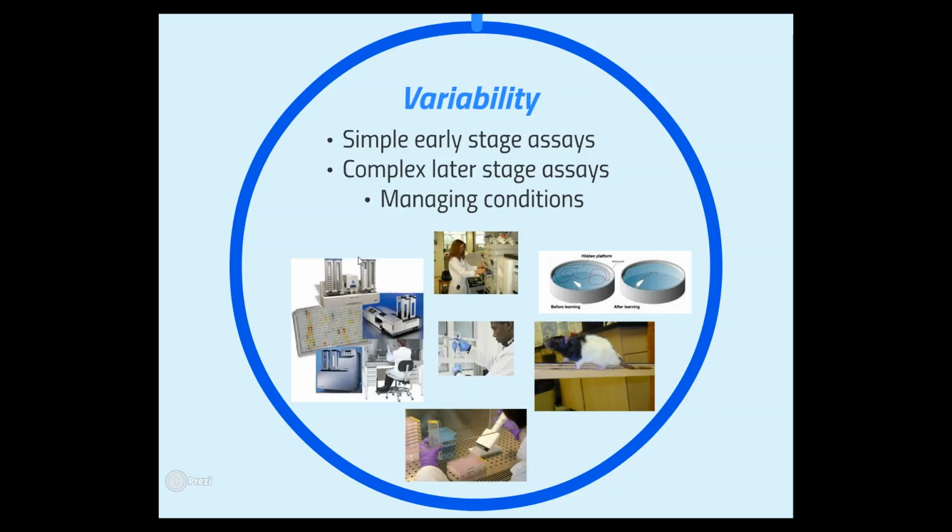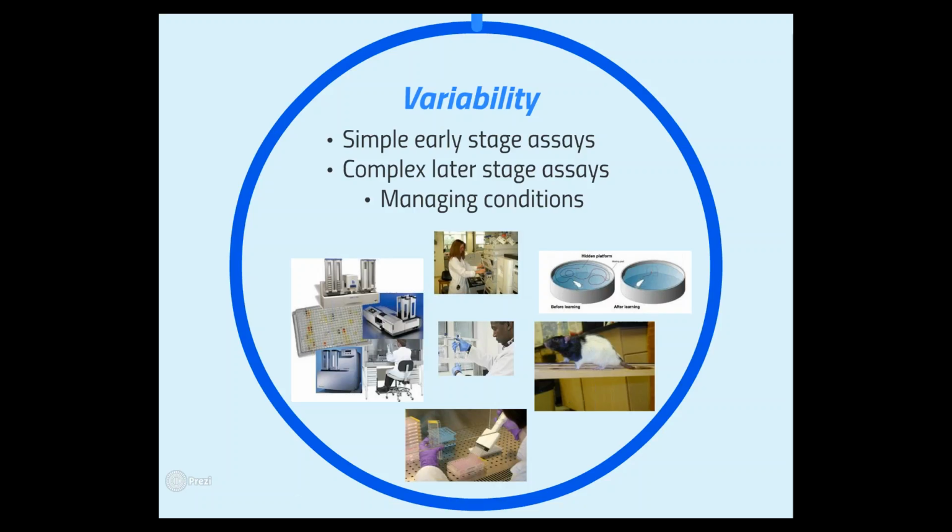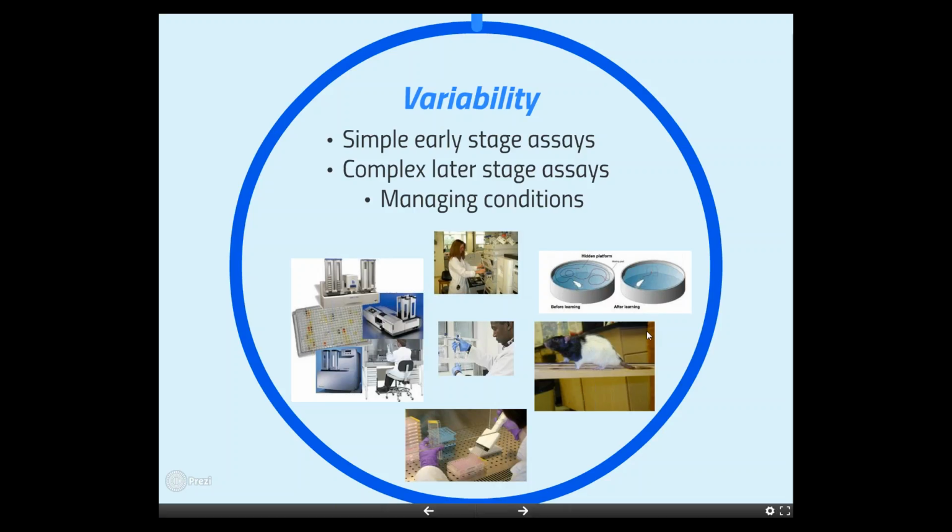So here we're talking about everything from screening work right through analytics work into the sort of medium throughput areas where things might be a lot more manual and more complex, and then into the sort of study work, where again it may be run over multiple months with lots of different subjects and lots of different mini experiments going on within the study.